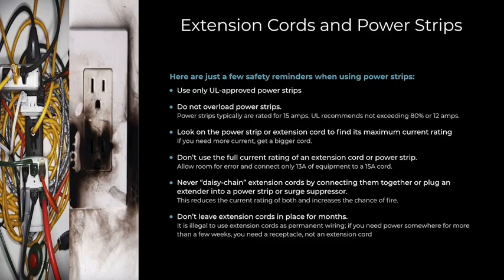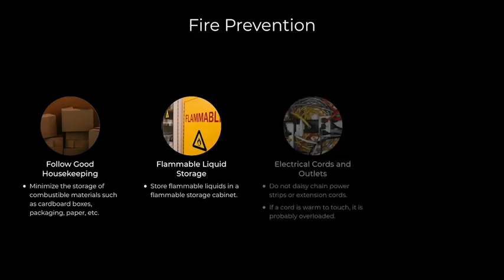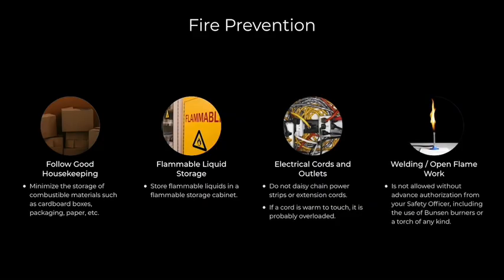Don't leave extension cords in place for months. It is illegal to use extension cords as permanent wiring. If you need power somewhere for more than a few weeks, you need a receptacle, not an extension cord. By following these guidelines, we can minimize the risk of fire and ensure the safety of all personnel.